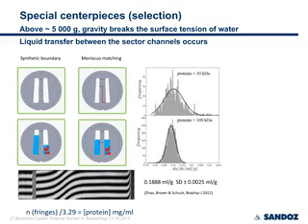Also useful is a meniscus matching centerpiece, which layers some buffer through this channel to the bottom of the solution of your protein, and the result is an exactly matched solution column, which is very useful if you have an interference experiment with a quite difficult buffer.